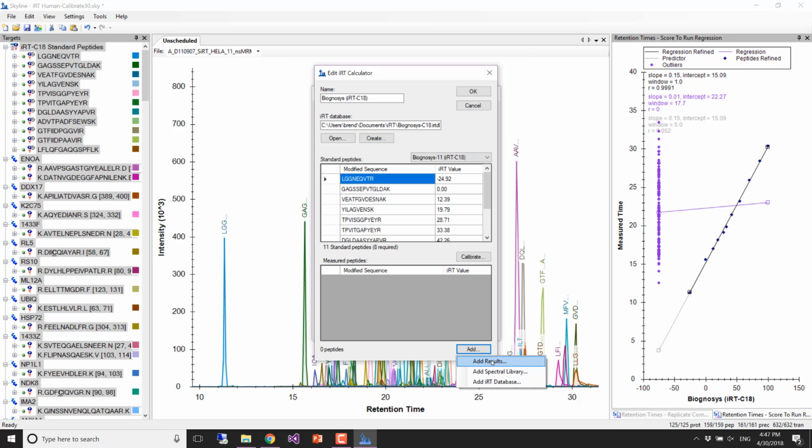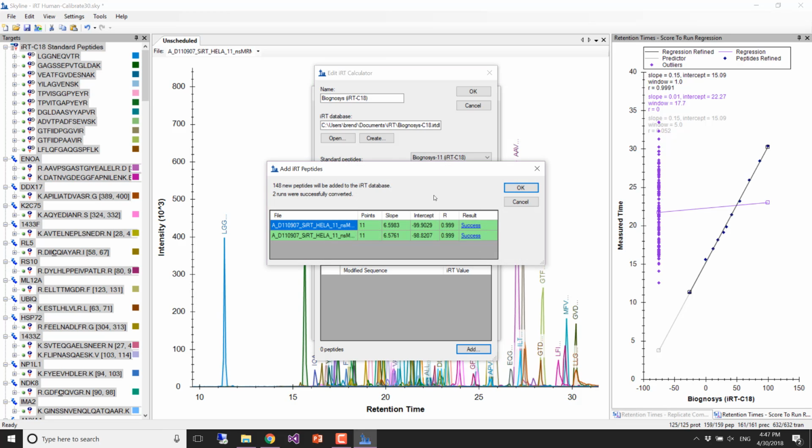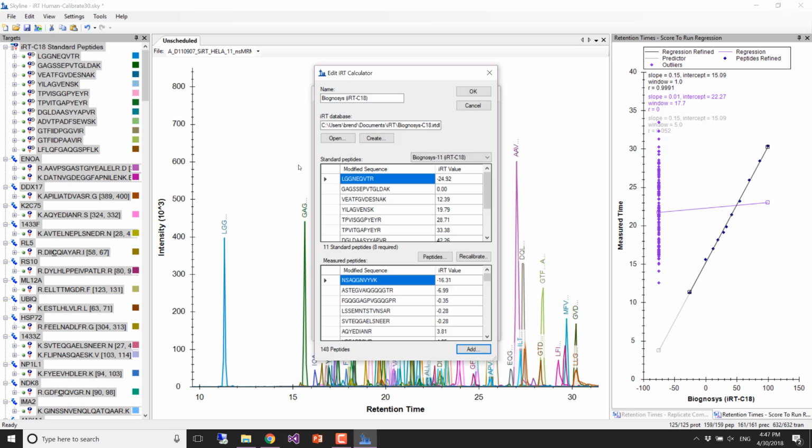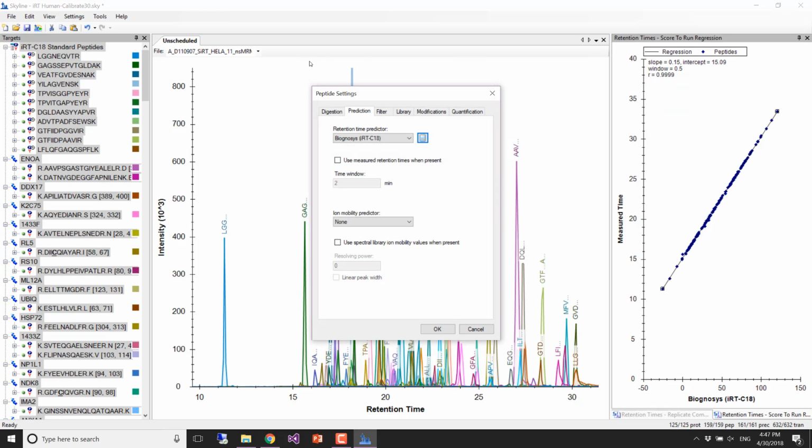So are you here? You with me? Click add results. It'll show you that it did a good job. Then it says, hey, do you want to recalibrate? And you just say no. And then you're done. And then we can now click OK on that.